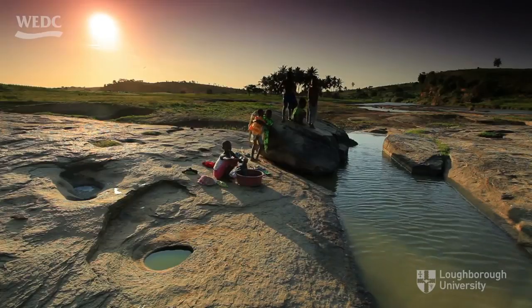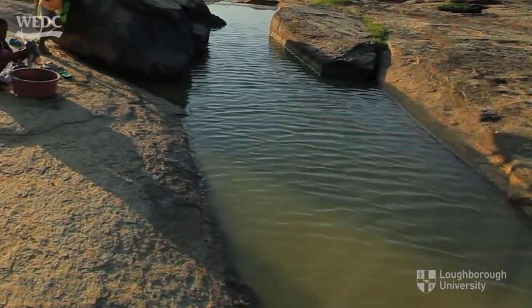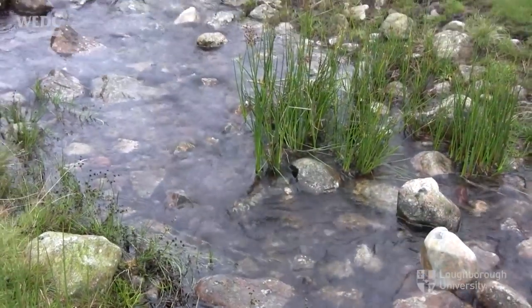For example, the turbidity would be high in a river full of mud and silt, where it would be near impossible to see through the water, whereas by comparison it would be low in clear spring water.